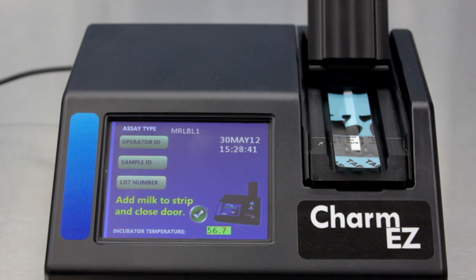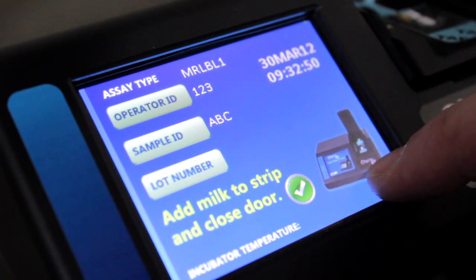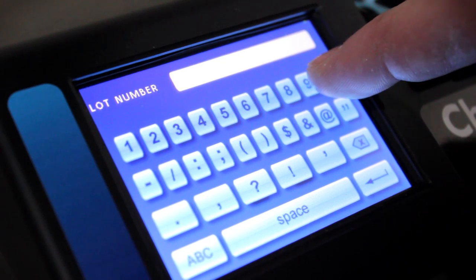Keep the door open and follow the on-screen instructions. Although optional, it is recommended to enter operator ID, sample ID, and lot number for each test you run.